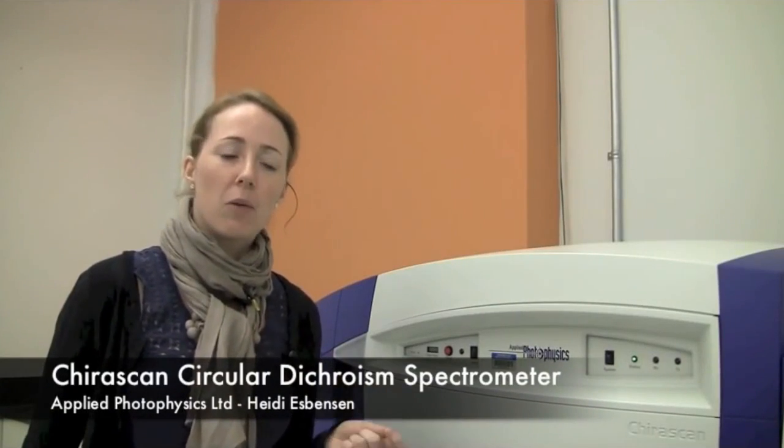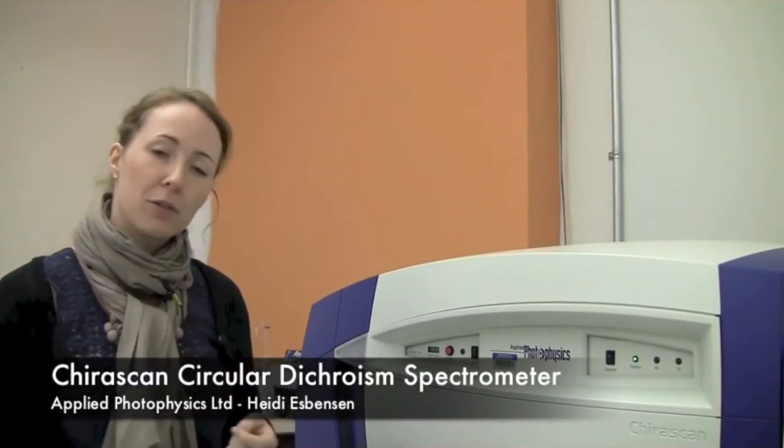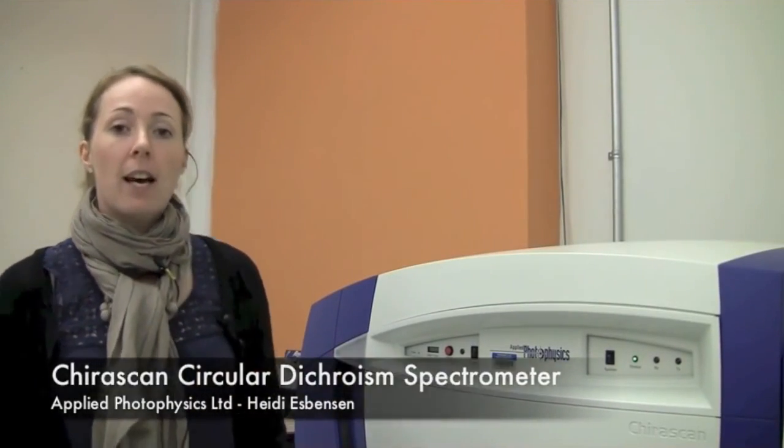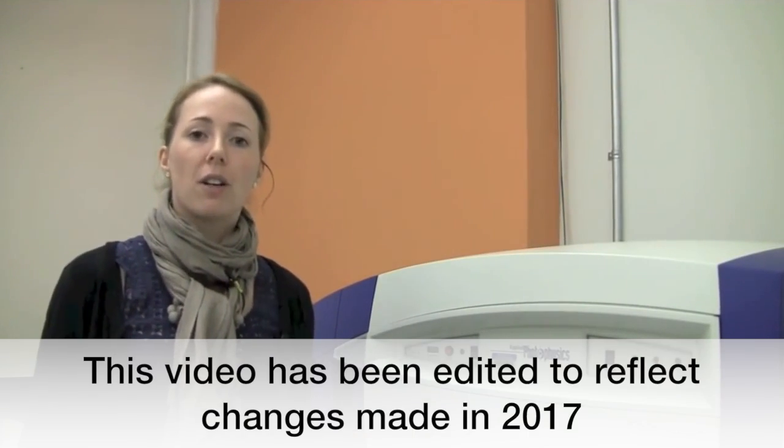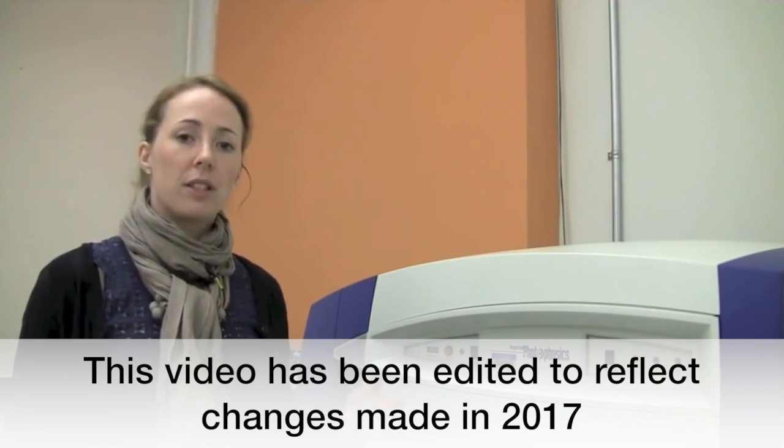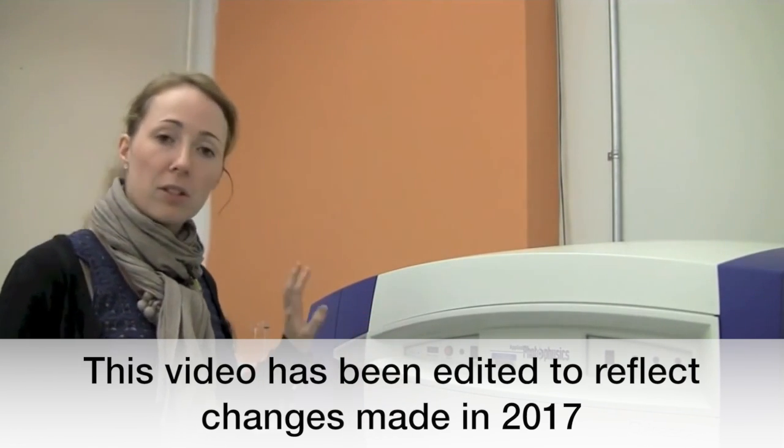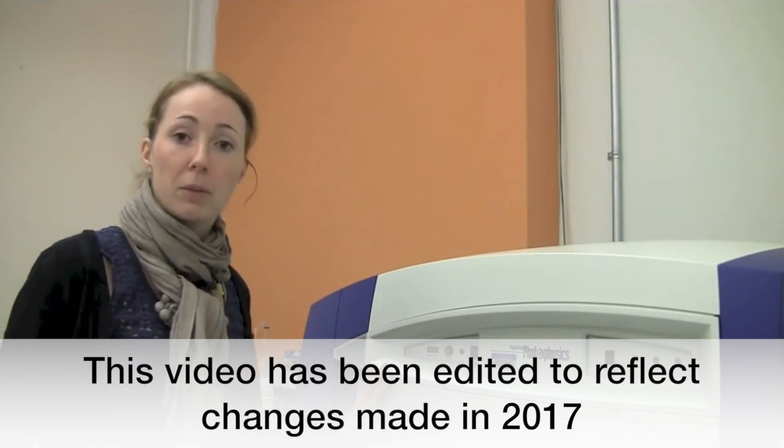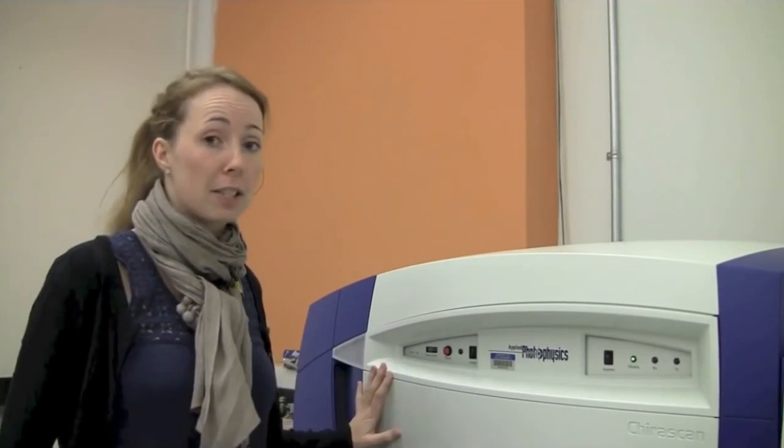My name is Heidi and I'm working for Applied Photophysics. I'm going to do a short video on how to use a CD spectrometer from our company which is called ChiraScan.